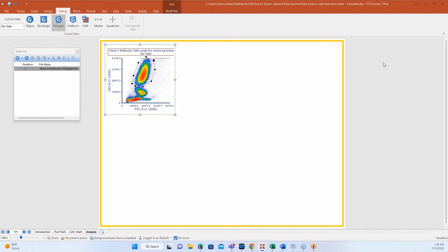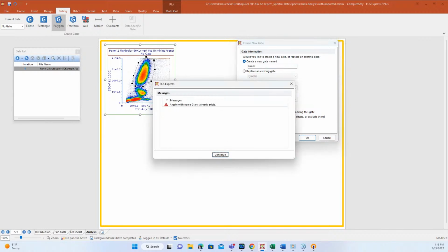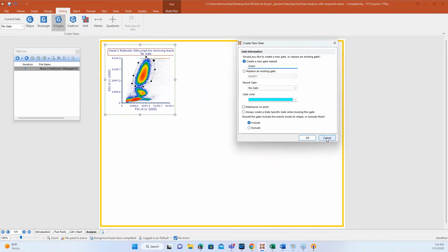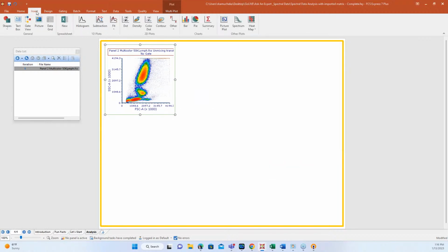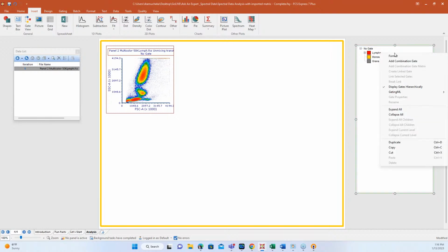All right, I'm going to just start creating some gates here. Oh, see, I think I might already have a hierarchy. Let me see here. Sometimes I do some work in the background and forget that I've done it. So we'll just insert that gate view. And look, we've already got something built. That's kind of great. Doesn't happen if you start in a new layout, but if you're doing some work, sometimes that'll pop back for you.